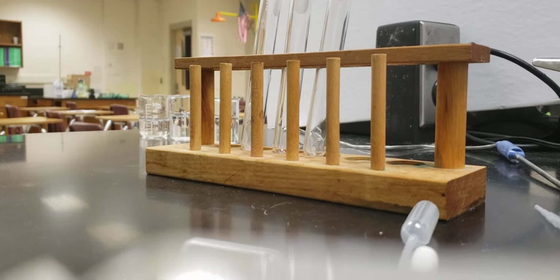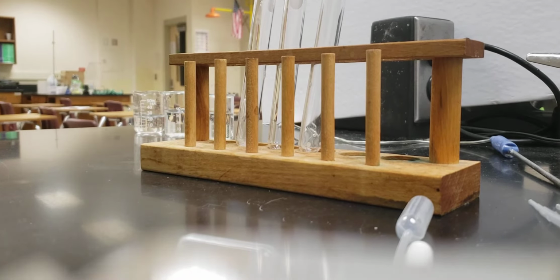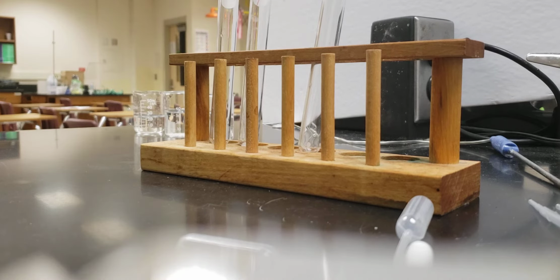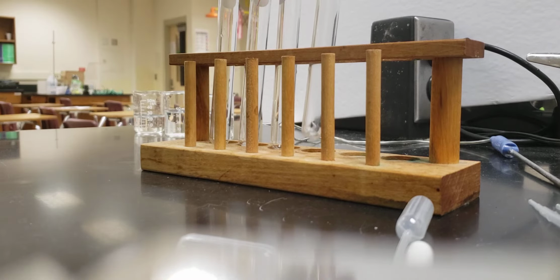The first one we're labeling X, Y, Z, and lastly we're going to do W because we're going to put the sink water in W.